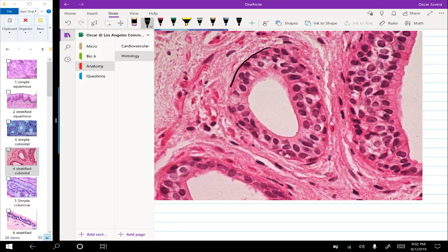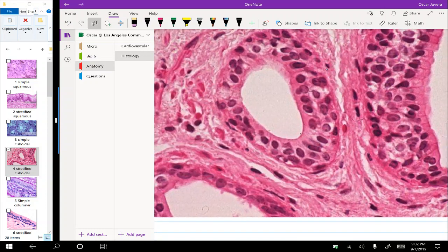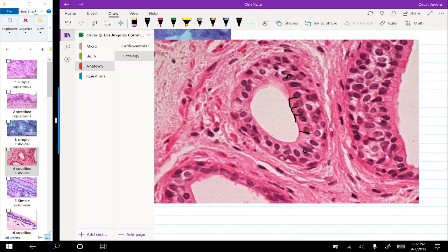And this right here, I hope you can answer this, it goes by two names, basement membrane or the basal layer, however you want to pronounce it. And we know that this is stratified cuboidal because 1, the donut, 2, they're boxy shaped, and 3, you can count the nuclei in the first row, and under that first row you have another set of nuclei right there. So right off the bat, stratified cuboidal.